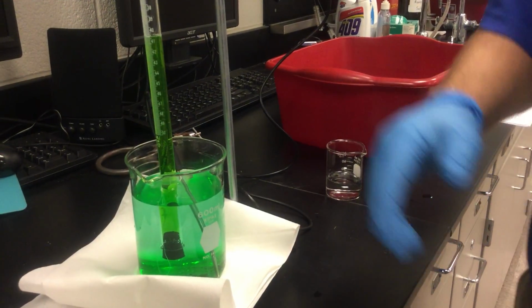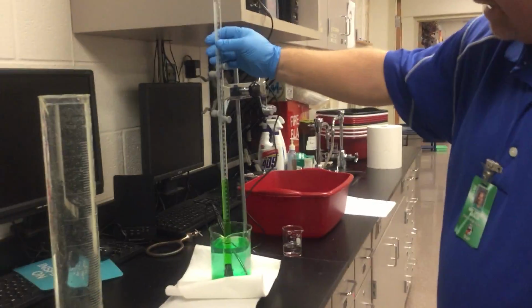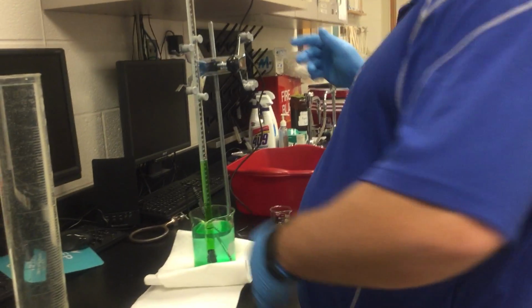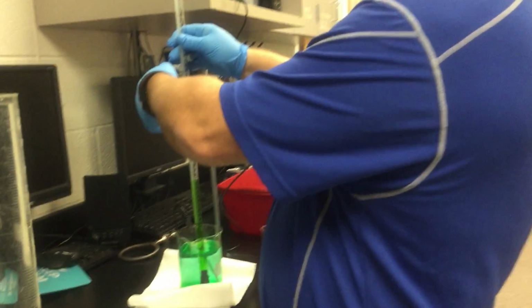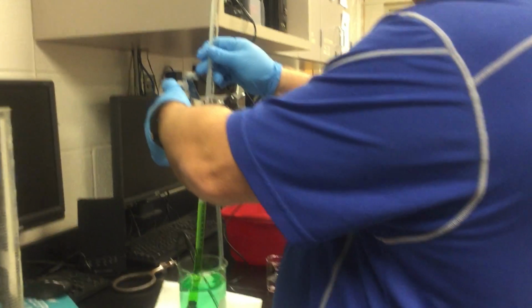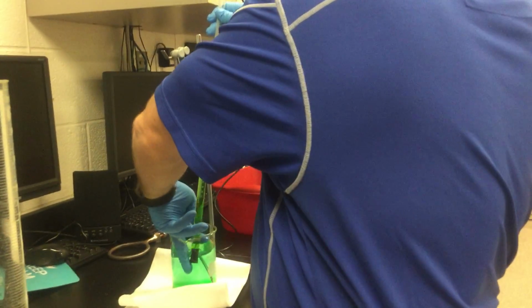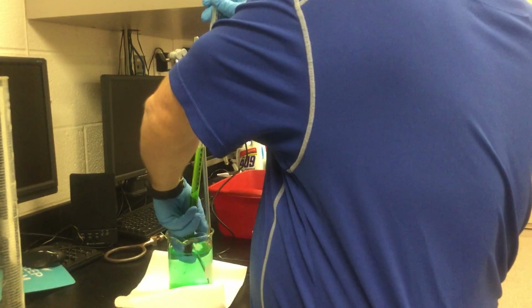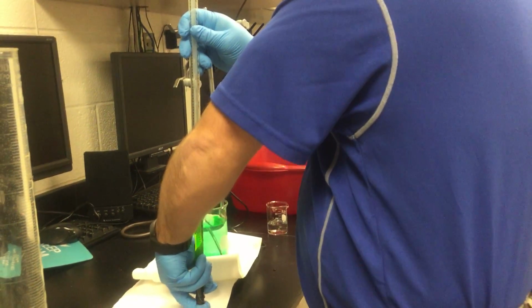So, what we are going to do, all right, is I am going to take this out of here. I have my finger so that I have no gas escaping out of there.